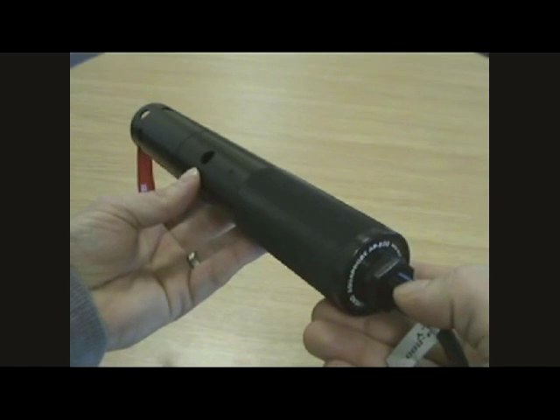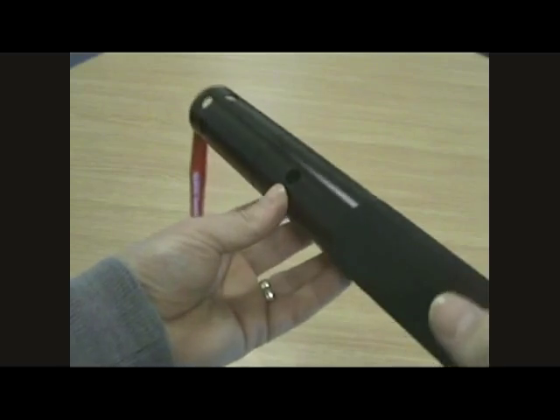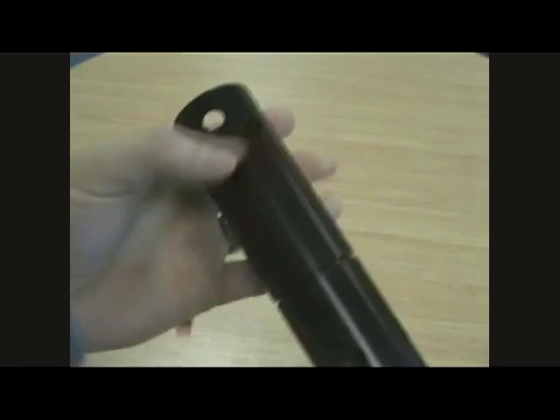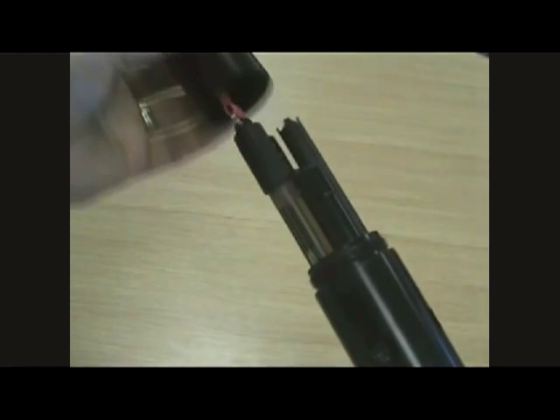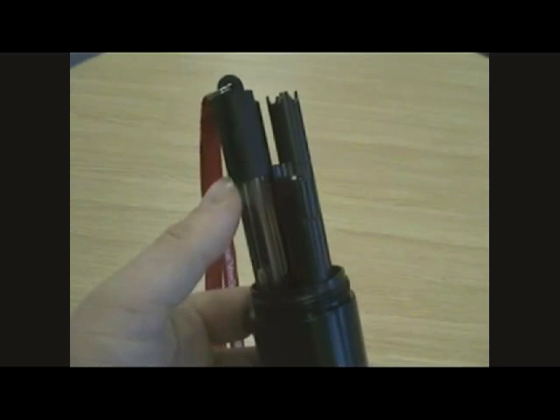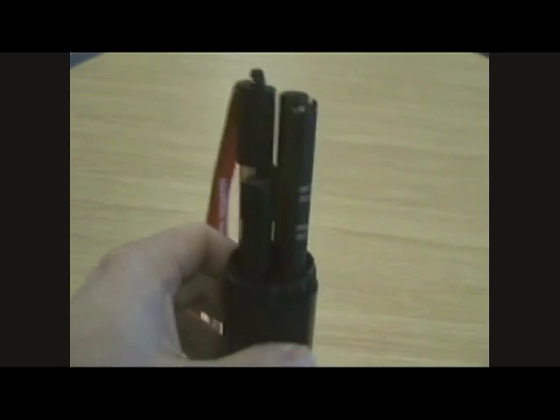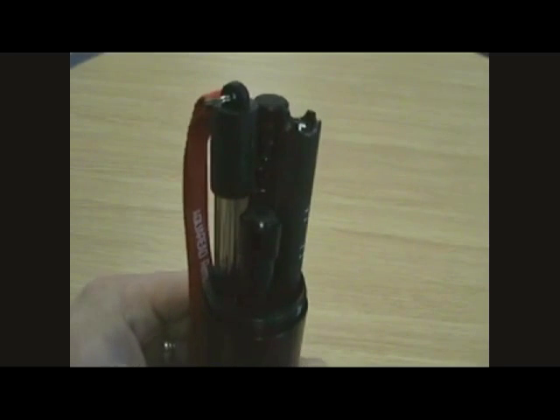This is the AP800 Aquaprobe. It's a very rugged unit, made from marine grade aluminium. It's rated IP68 for permanent immersion. At the front end of the probe is a removable sleeve. Once the sleeve is removed, you are able to access the electrodes for cleaning. The electrodes concealed within are the pH electrode complete with pH storage cap, the combined conductivity and dissolved oxygen sensor, and in addition, the turbidity sensors. Our turbidity sensors are nephelometric and conform with the ISO standard 7027.